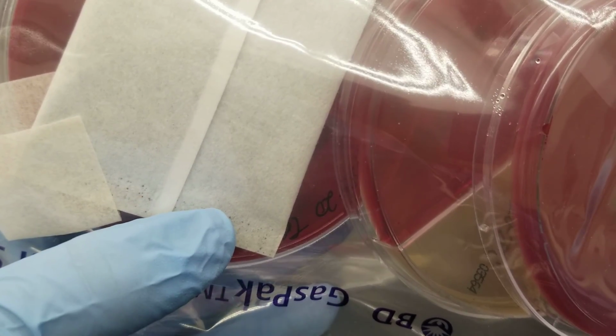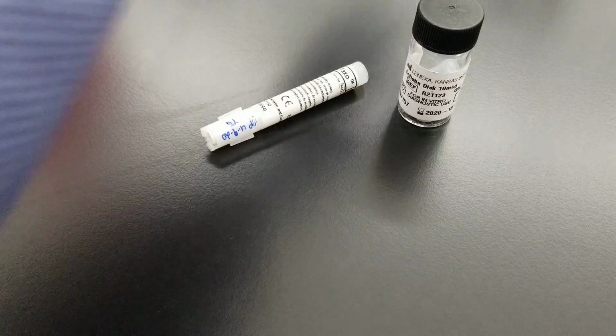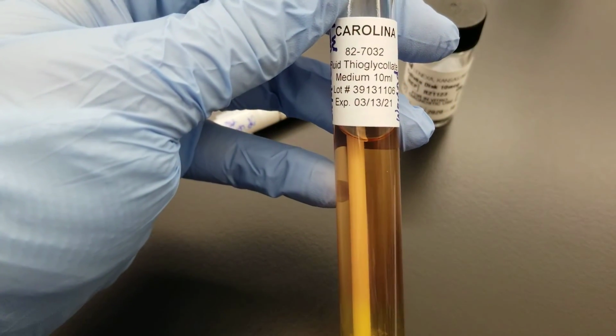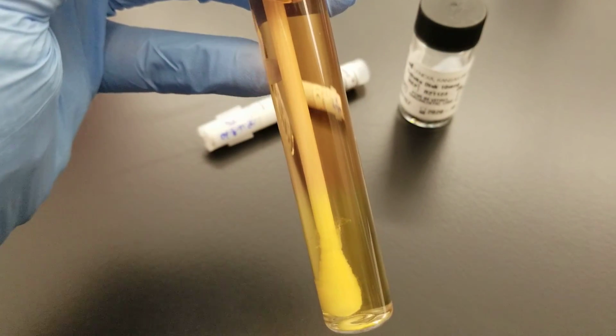Okay, and so you should also end up using a thioglycolate broth in order to grow any organism that may not be present. This one has a swab in it. I didn't mean to grab that one.